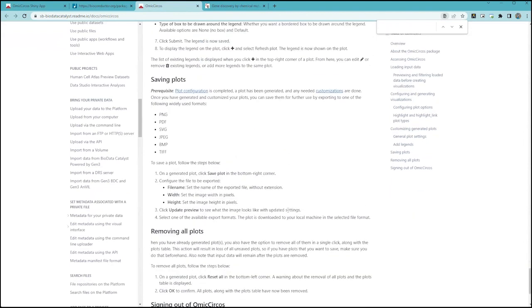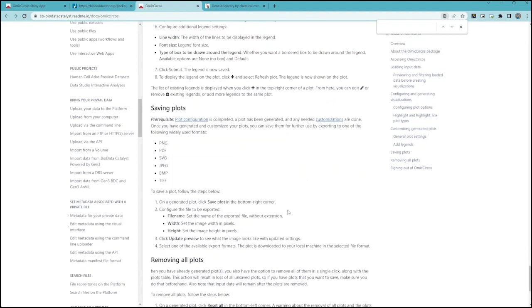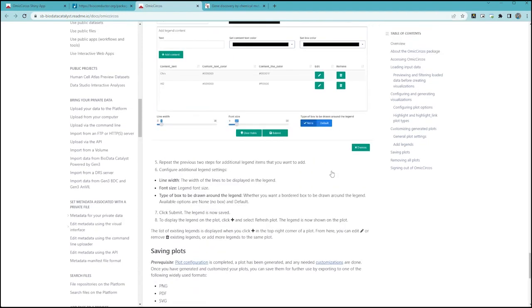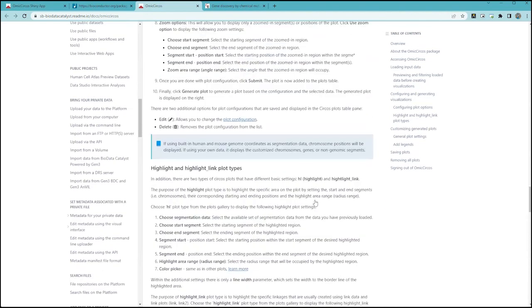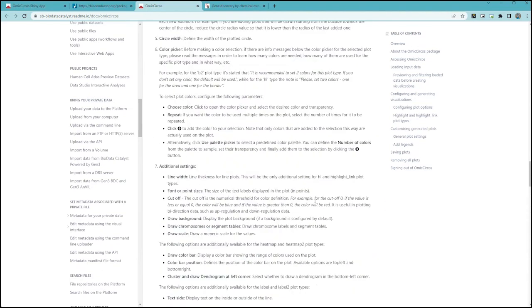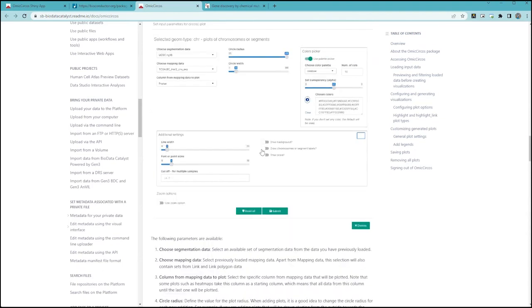And is there any idea if there's any restriction with respect to what file size can this use? Good question. I don't know. I can follow up on that as well. Okay. But yeah, a lot of potential there. And we need people to try it out in the community.